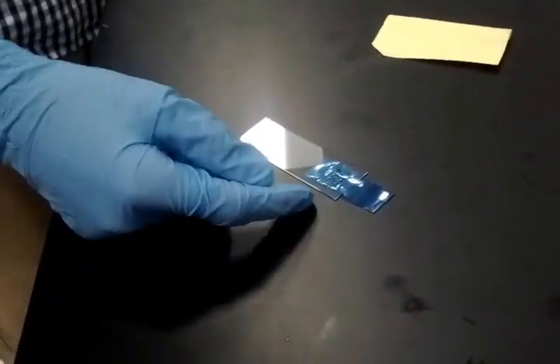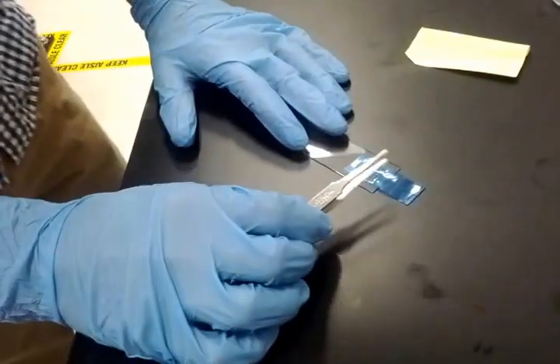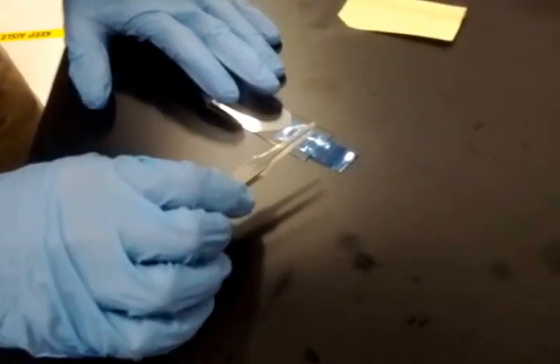So this is called blue tape? Yeah, it's a blue tape. I don't know the specific scientific name. Okay, and what does it do? That's a good question. It's a little bit sticky, so it will hold your crystal. The alternative is to use scotch tape, but scotch tape is extremely sticky. Then you will have a hard time getting that out of PDMS, I think, because PDMS is not strongly held on the slide, so you don't use scotch tape. I don't know if anyone uses scotch tape on PDMS, actually. But blue tape can be used on silicon dioxide. I think people do that.